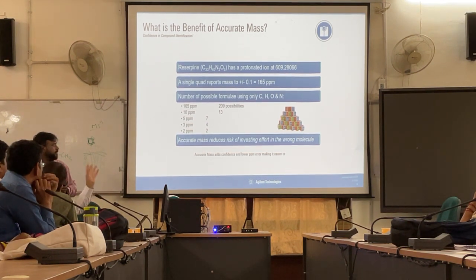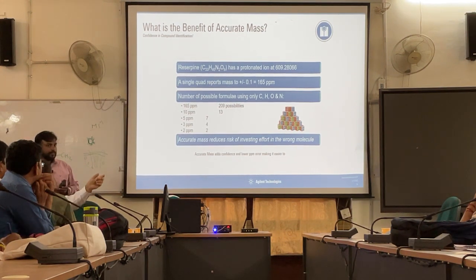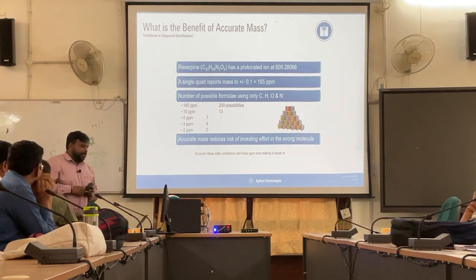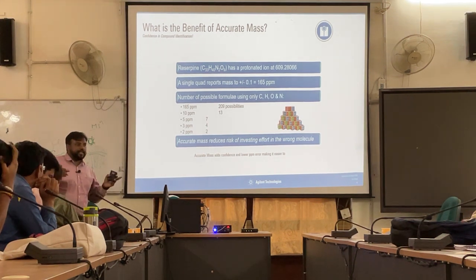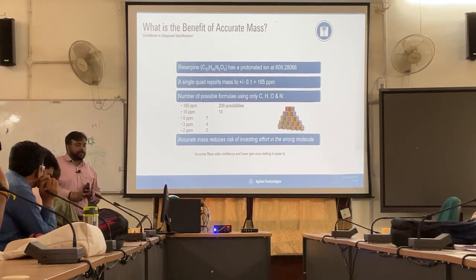Mass of 12, hydrogen has 1.008. So how many hydrogens? If you have 10 hydrogens, you can get that fractional mass from that hydrogen. That is the basis for prediction of formula. Exactly. So once you acquire the same data on a QTOF, you will get the entire isotopic fidelity.